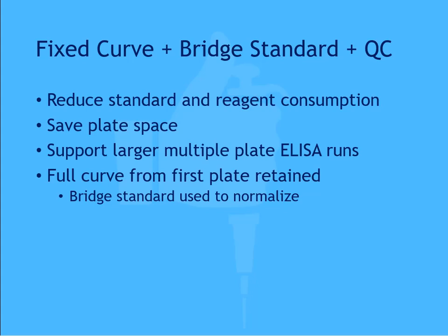With an appropriate blank, bridge standard, QC sample, predefined control rules, and method qualification, this workflow can provide a practical way to manage multiple plate ELISA analysis while optimizing plate and reagent usage for the maximum number of unknowns measured.